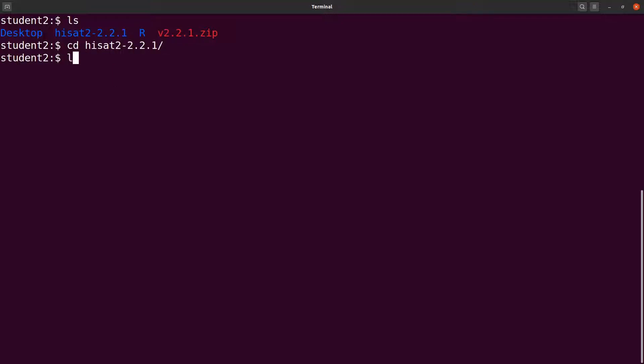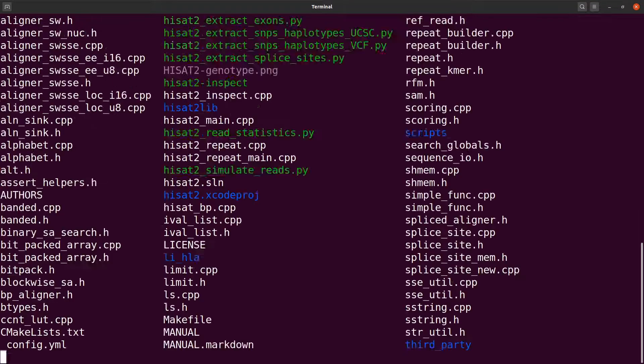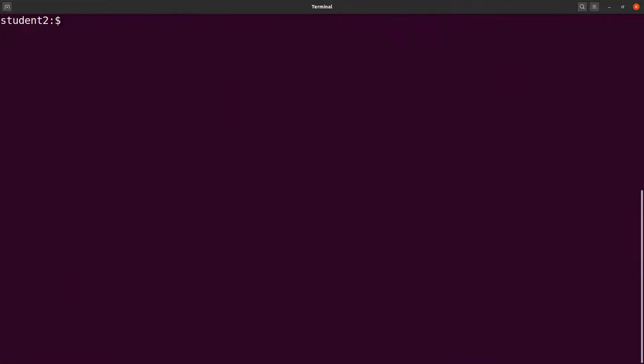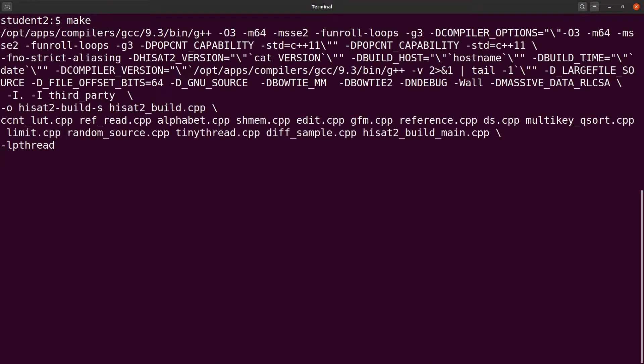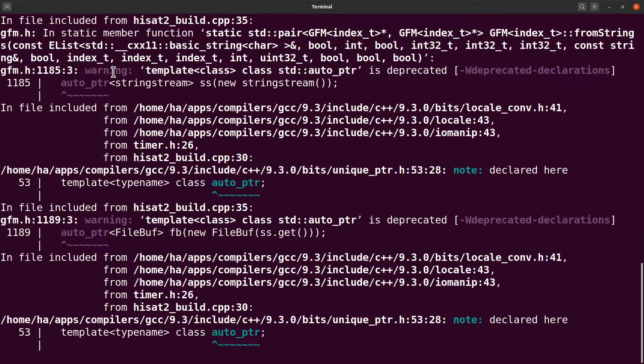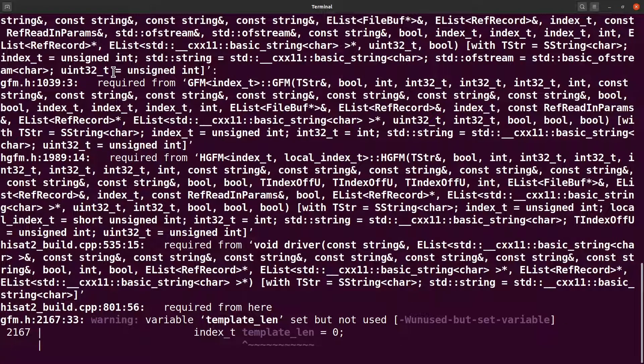Let's cd into that directory. Let's do an ls and we have some files here. Let's clear the screen and continue. We are going to use the make command. I will say make. And then, the source will be compiled and then you will finally get the binaries. Let's wait and then see how it goes.